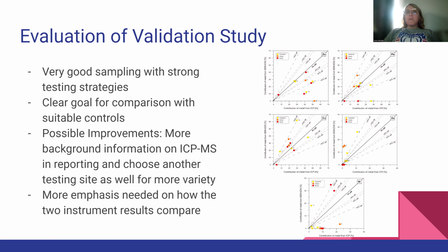Some possible improvements that I personally would have made on this validation study is I would have provided more background information on the ICP-MS in the reporting. When I was reading through the study, there wasn't as much information on what ICP-MS was and what they did for the ICP-MS testing. It was more focused on the SEM EDX.